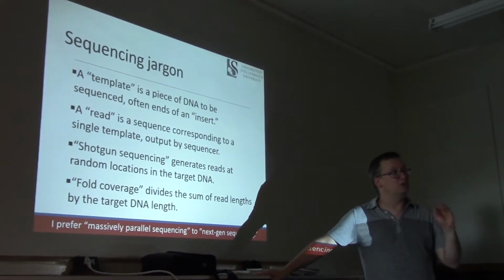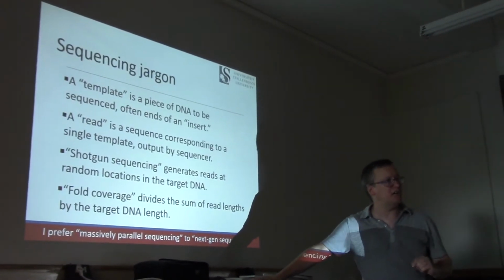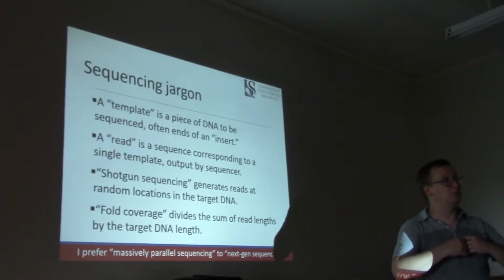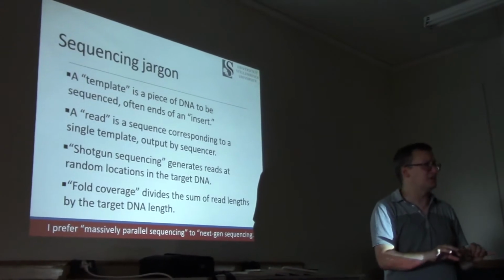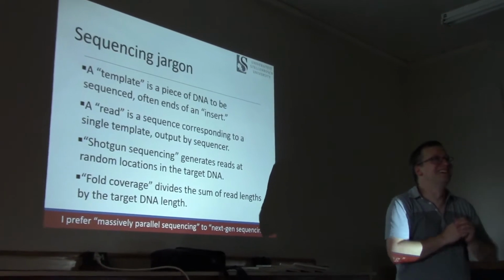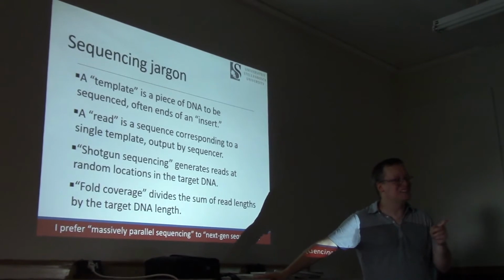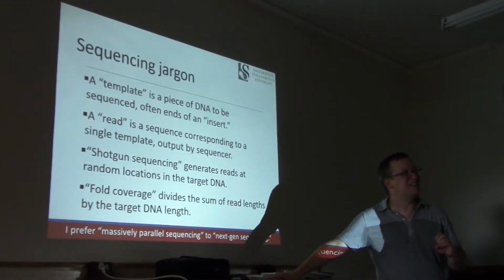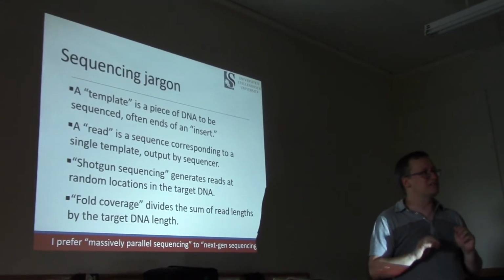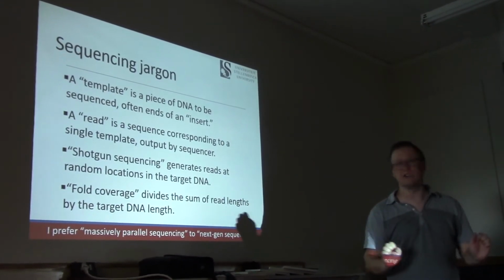So if you're doing whole genome shotgun, you have a lot less control over which pieces of DNA are going to get sequenced. And generally speaking, you're dealing with sequencing reads that are much shorter than in the old days as well. So what you're hoping to do is effectively work with an old quote from, I believe, Stalin, who said, "Quantity has a quality all its own." That the old day sequencers, the old Sanger sequencers and so on, would give us very few sequences, but they were longer and they had better quality in general.